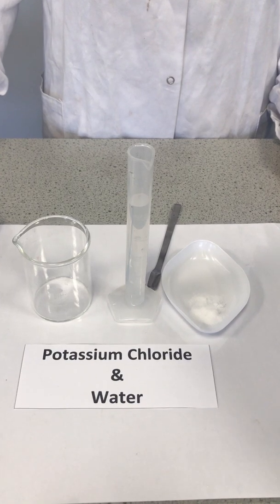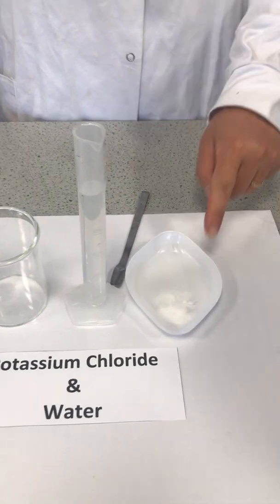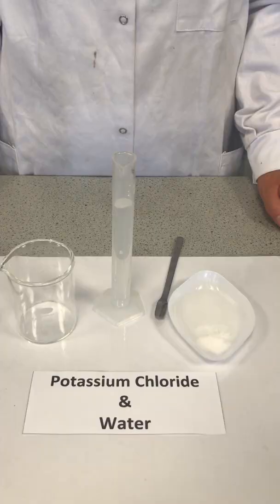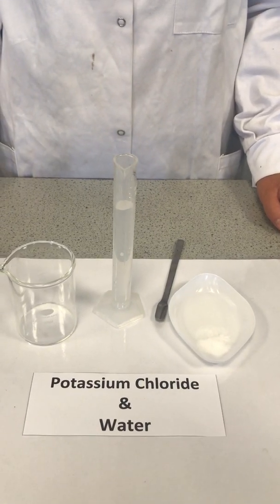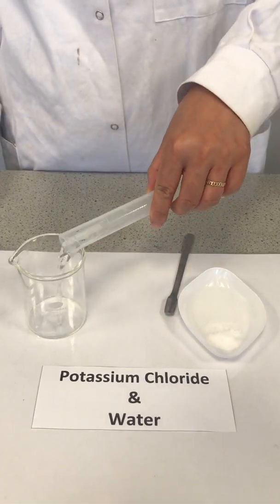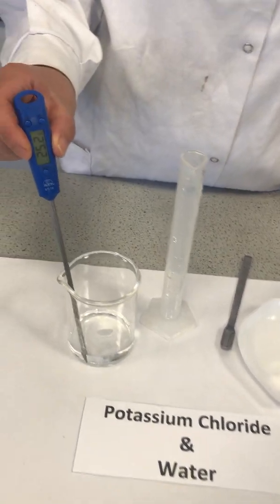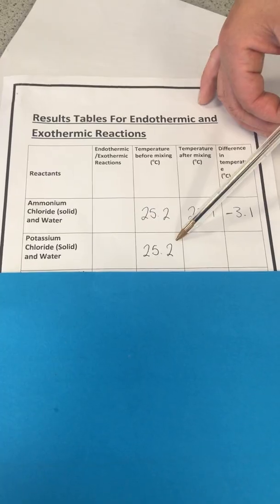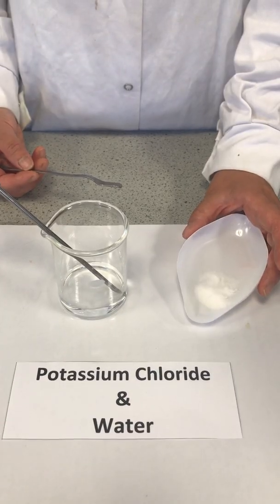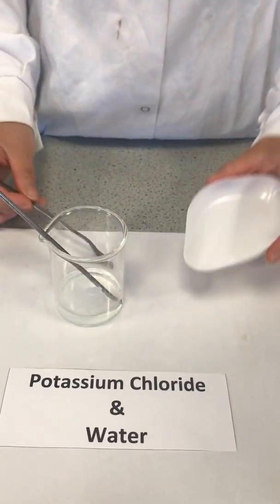Experiment 2. Reaction between potassium chloride, which is a solid white powder, and water. We will follow the same steps we did earlier. We pour water into the beaker and record the temperature. Now we add potassium chloride into the beaker, stir nicely, and record the temperature.